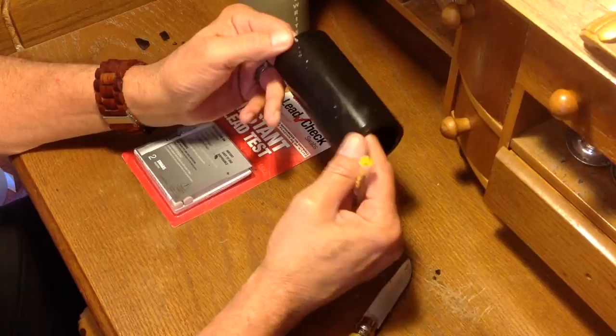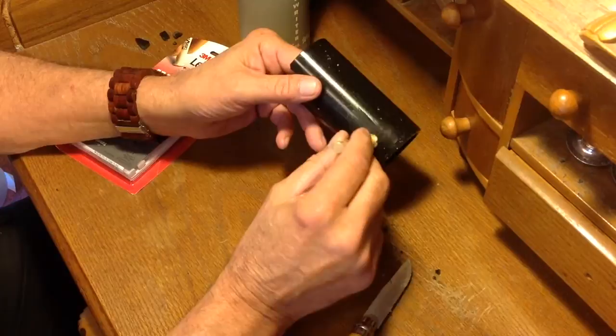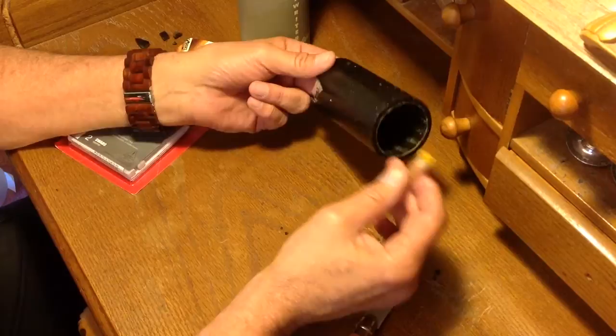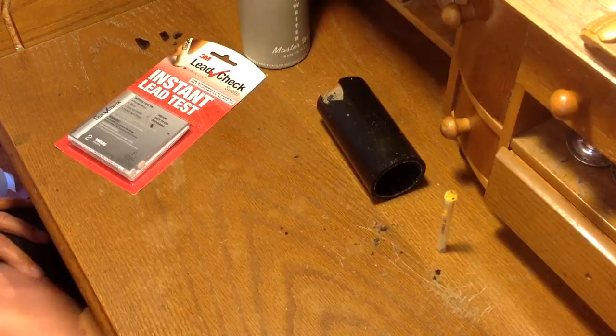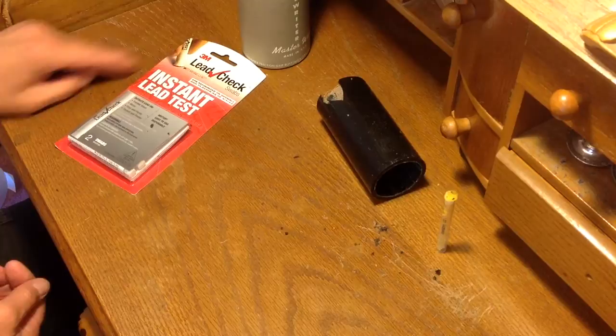I don't know where this information came from, but I work with these blanks every day, so I wanted to make sure. The testing laboratory said this is the same test they would do if I paid them to do it, so it seemed like the logical way to proceed. As you saw for yourself, it has no lead content at all. This is basically the same formulation as brown wax, except they've made it black. I just wanted to do a quick test so you could see for yourself and eliminate any fear that shaving these blanks is in some way hazardous to your health. They contain no lead at all — zero. There is no molecular lead in them of any kind. The test was completely zero. There is no lead content in black wax dictation cylinders.